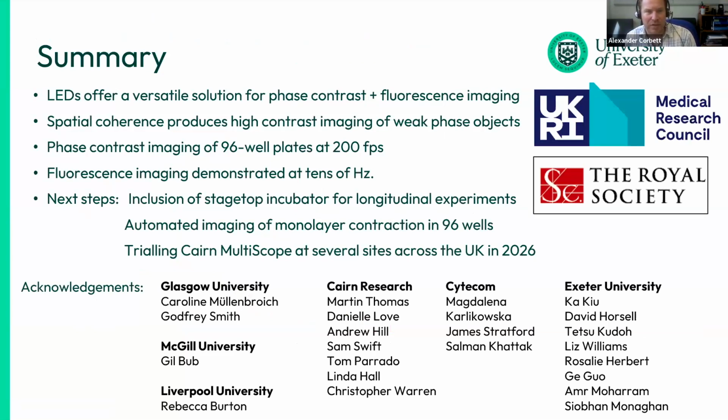As I said, a lot of the magic we're getting from this is from the LEDs, which offer a variety of different source wavelengths and very small emitter sizes that enable us to image samples with such high contrast, as well as using them for fluorescence imaging, even in the UV, as we've just seen, providing the spatial coherence to allow us to see even very weak phase objects, being able to exploit the developments of new cameras to acquire images at very high frame rates, and fluorescence imaging we can acquire at very high frequencies.